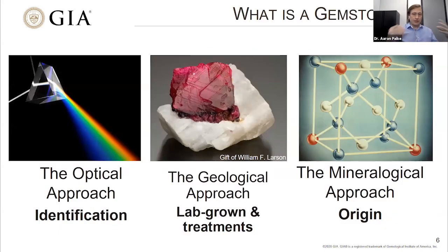Now, with all of these techniques, this huge laundry list of things that we can use to study these gemstones, you have to face the question of, well, which technique do you need to answer the question that you're asking? And I think it kind of depends on what you see a gemstone being. So what is your perspective?